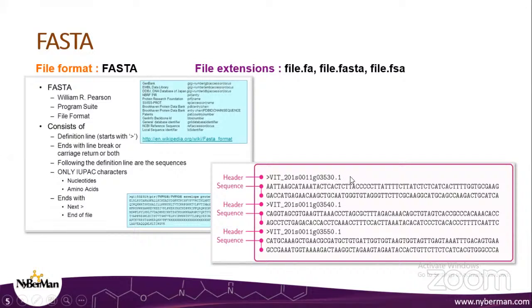Some sequencers give complete information in the header, such as what chromosome it is, what the sequencer name is, and whether these are forward reads or reverse reads. Like the sequence is read from the starting point, 5 prime to 3 prime or 3 prime to 5 prime. So these keywords you might already be aware of. If you don't know about 5 prime and 3 prime, you can drop your query in this discussion forum, or you can also explore, and then I can answer there.